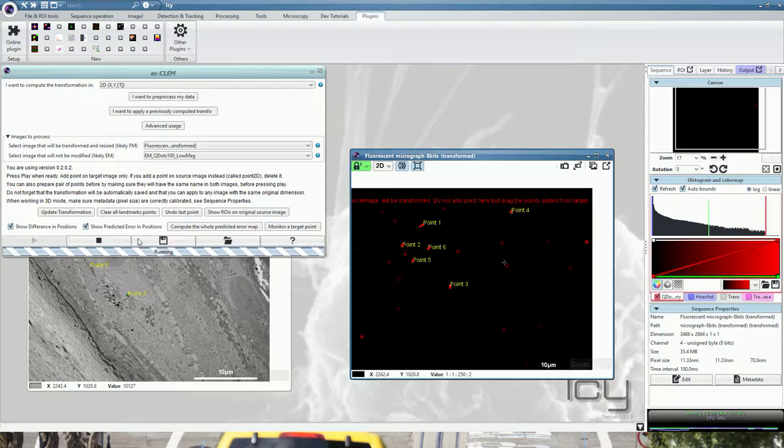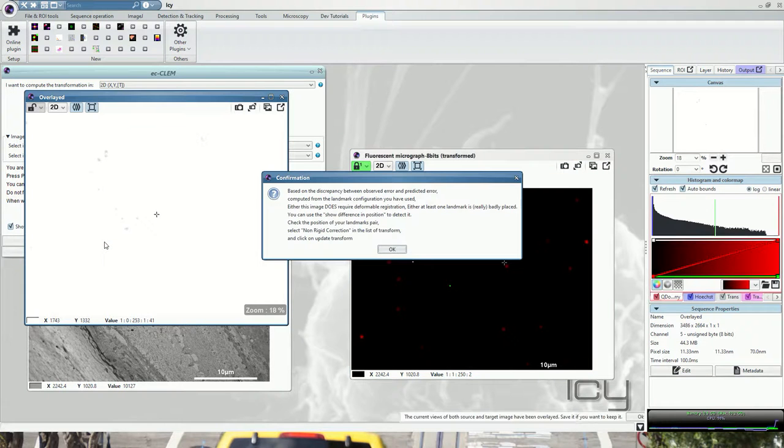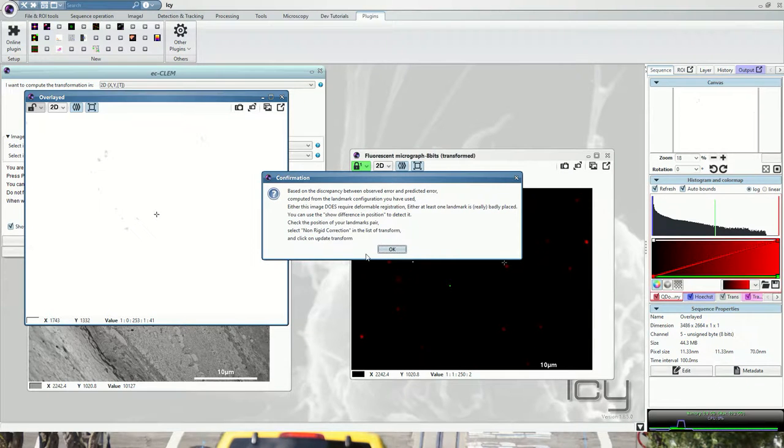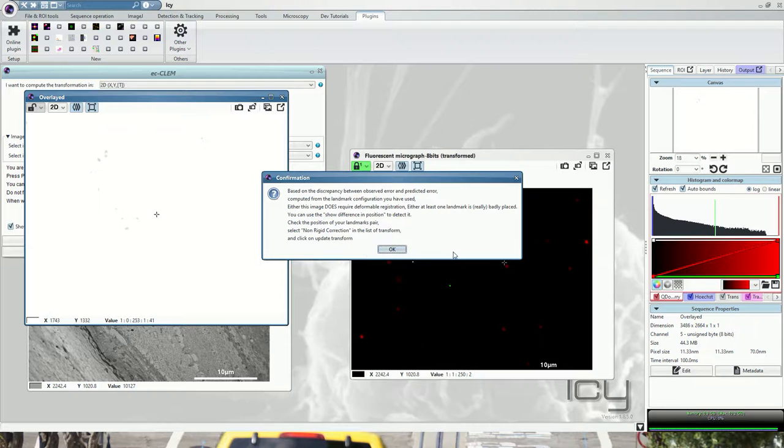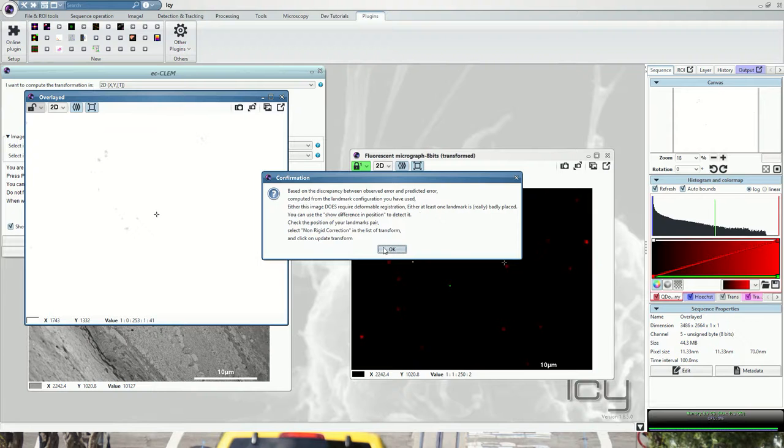Once you have placed enough points, press the stop button and it will give you two things. First, it will create an automatic overlay of all the different channels, and it will tell you that based on the points you have placed, you might want to do a non-linear transformation, non-rigid correction. In some cases, this also illustrates that one of the points has been badly placed and is an outlier that you might want to correct. But this will be addressed in another tutorial.